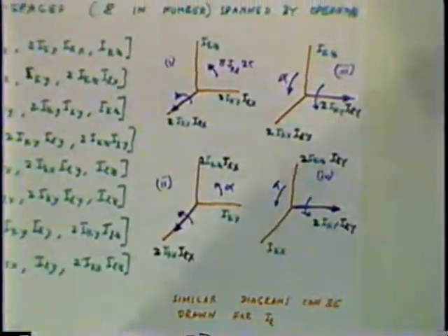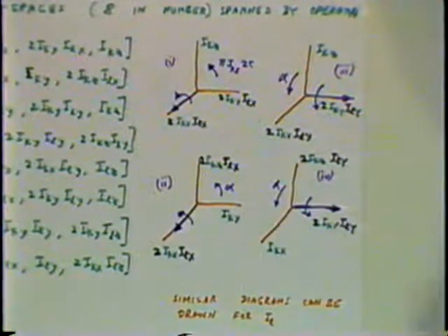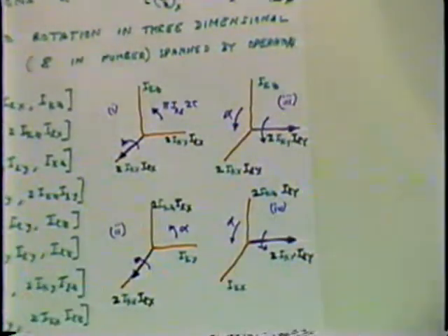And so the evolution under various different terms of the Hamiltonian of various operators can be even more simply looked at with the use of this picture. If you have one of these terms which is causing evolution, and one of these terms which is what you want to look at, it's a compact way of getting the result.